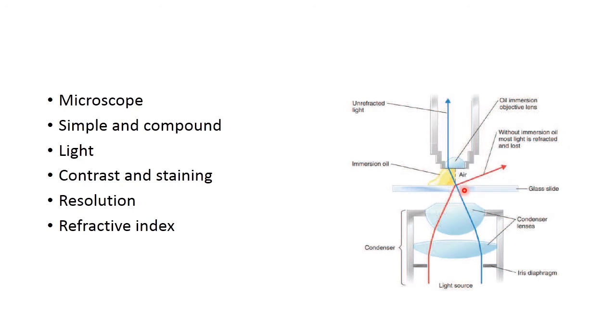Here in this example, only one ray of light is shown deflecting. So only a little amount of the signal in terms of light collected is going to be transferred to the objective lens, and some of the information in the form of refracted light is going to be lost. This is typically important when using higher magnification lenses because the intensity of the signal can significantly decrease because of the refracted light. This problem can be prevented by using a technique called the immersion oil technique.